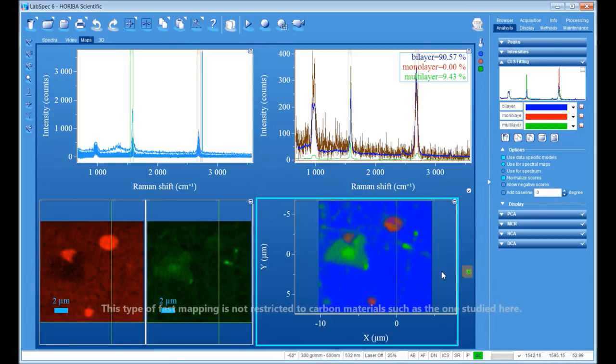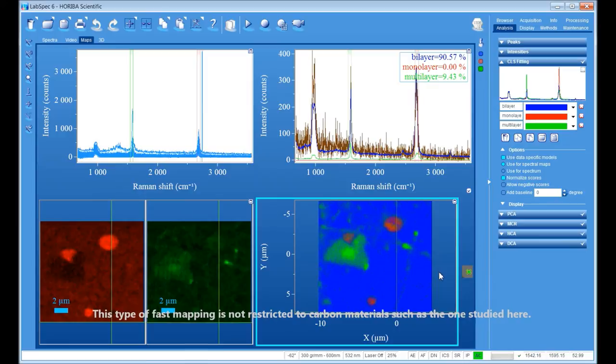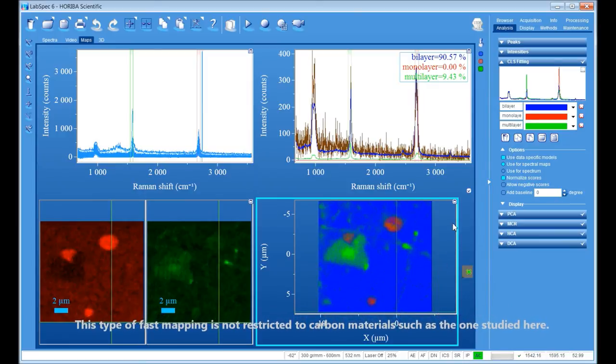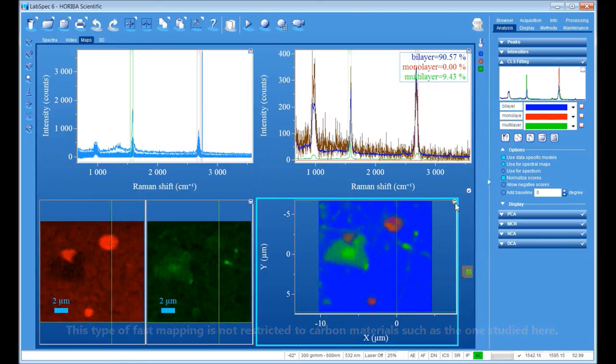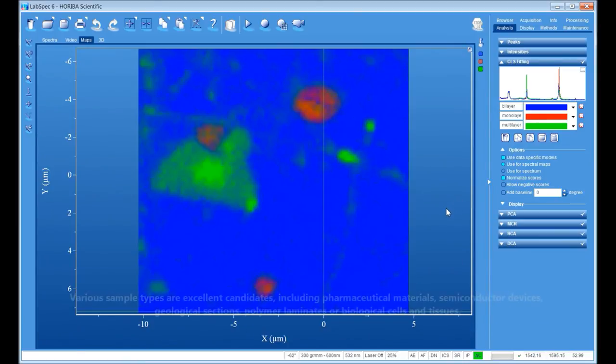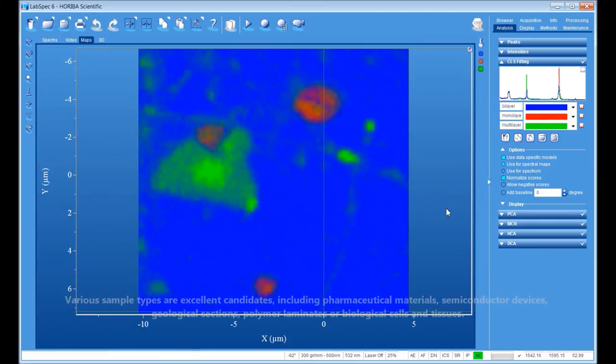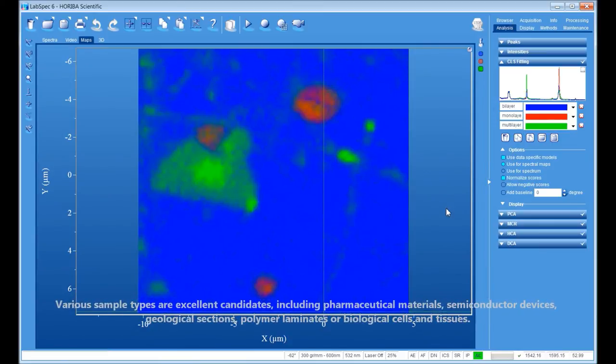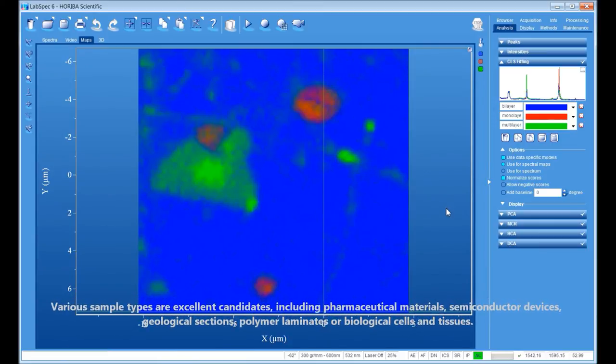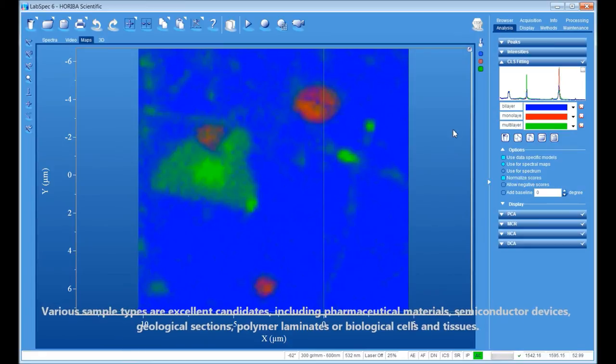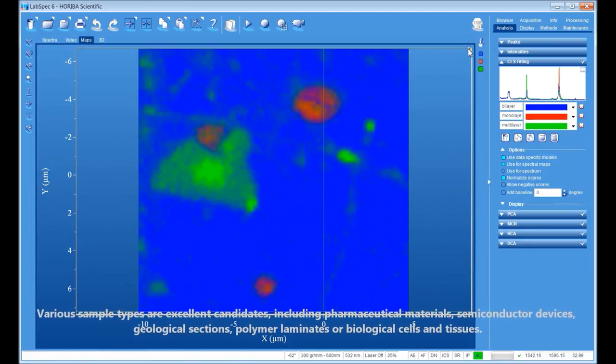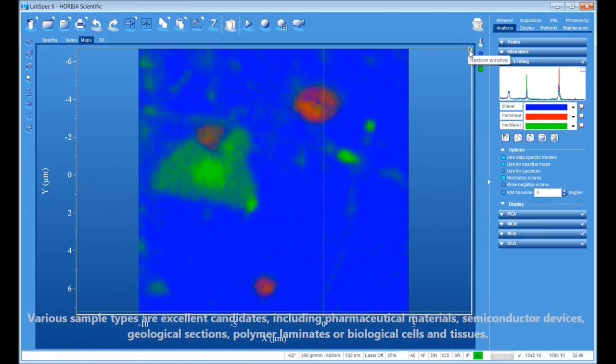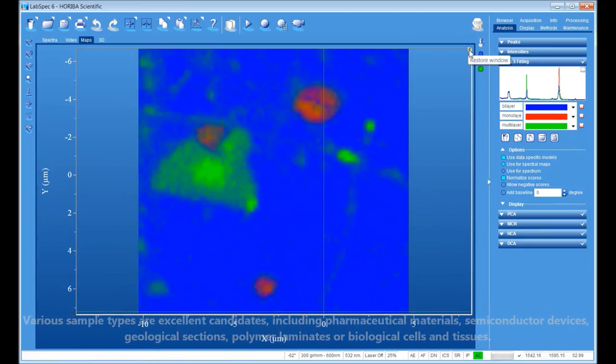This type of fast mapping is not restricted to carbon materials such as the one studied here. Various sample types are also good candidates, including pharmaceutical materials, semiconductor devices, geological sections, polymer laminates, or biological cells and tissues.